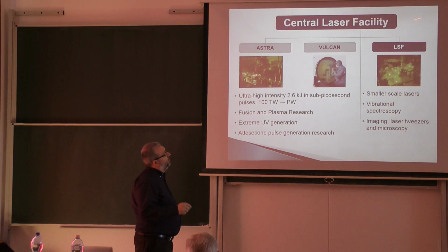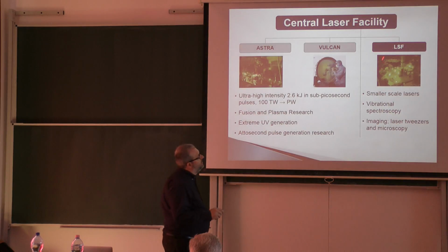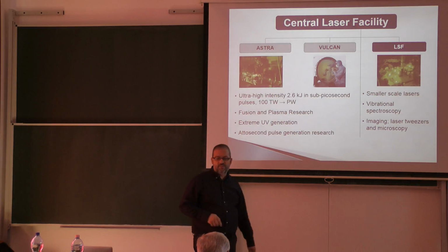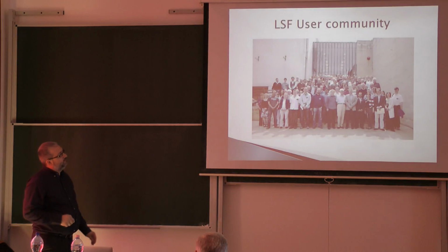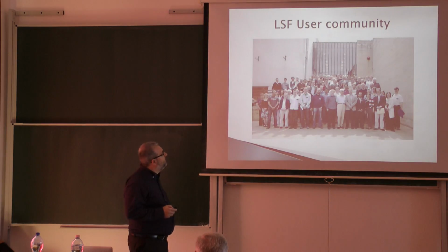And we are using smaller energies and milder lasers in our case, the Laser for Science Facility, for vibrational spectroscopy and for laser tweezers, and also a microscopy system which is called Octopus, if you have heard about it. Now, this is the LSF user community, and this was a meeting a couple of years ago.